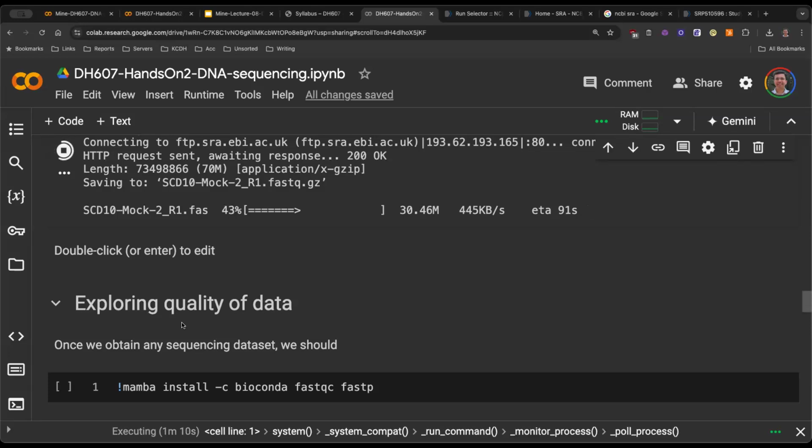Once you attach the adapters, it will go sit on this flow cell. I'm just going to call it FC, flow cell. It will get amplified here. It will make multiple copies of just this fragment. And then this portion, the fragment that you wanted to sequence, that is the insert. It's just a different name for that. It's called the insert. So your sequencing will begin, if it is R1 and R2, it will begin from this side, it will begin from that other side, and you will get an insert. This is what you ideally want to sequence. Does that make sense?